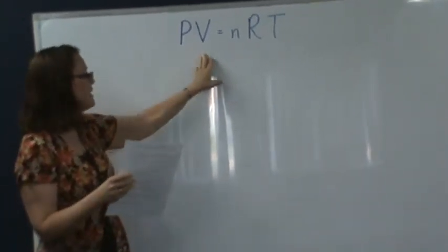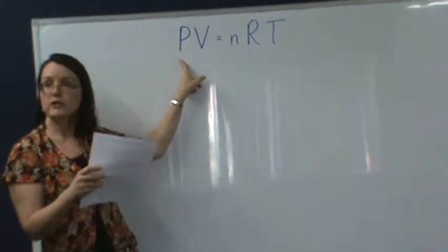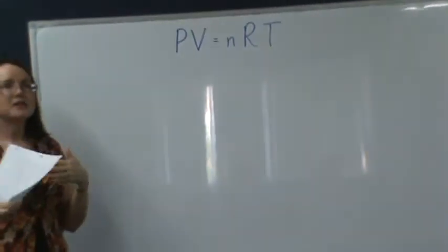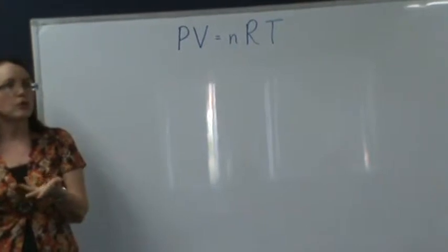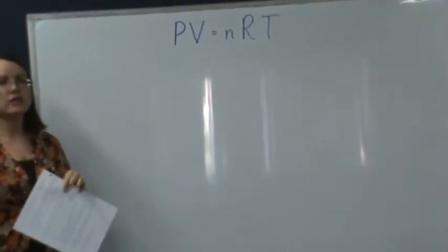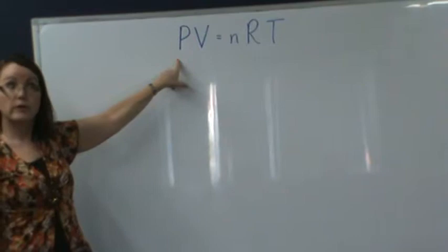So essentially, the variable you're finding with this experiment is going to be V, okay? Pressure, you're going to be getting from, I'm actually going to look it up, there's a general figure you can use that's probably correct, but you can actually look up on the weather reports what the actual atmospheric pressure is today. It does tell you how to make a conversion for pressure. So we can get this from the weather report, okay?